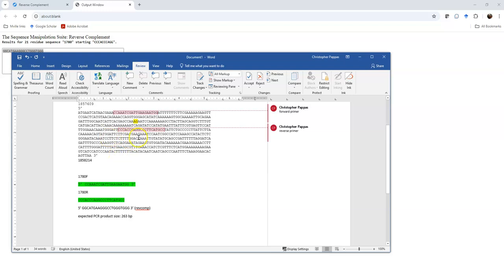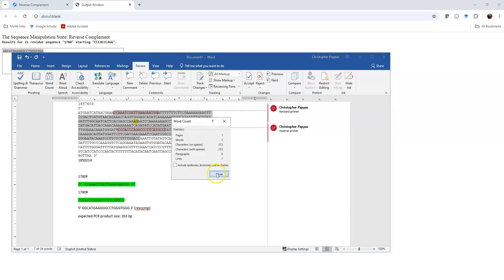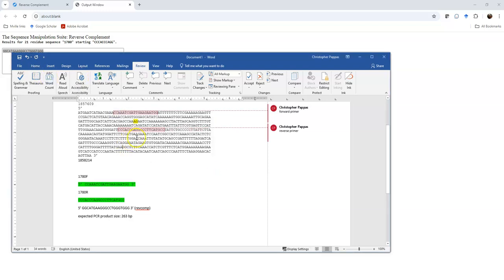Maybe I'll pick something down here. I look here, here's a different primer sequence, like maybe just like that, starts with the C, ends with the C. And if I had grabbed this instead, this is probably like 350. Let's see. Yep, 372. I kind of like that better. So I might go back and say to myself, you know what? I'm going to design this primer instead. But this just really shows you how to do the primer design itself. It shows you how to make the forward and the reverse.